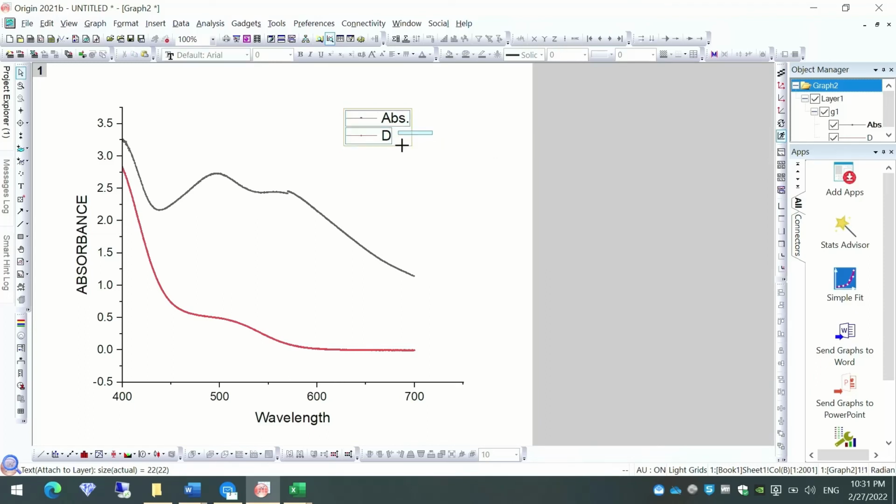And of course you can change the name here, like for example, this black line is maybe your compound 1, so you can double click on this and change it. You can say, okay, this one is my complex 1, and this one is the spectra of my complex 2. So that's how you can do it. You can again change the width of this line and make it look much better, and we can then scroll it here. So I think this looks pretty nice to be put anywhere in your scientific report.